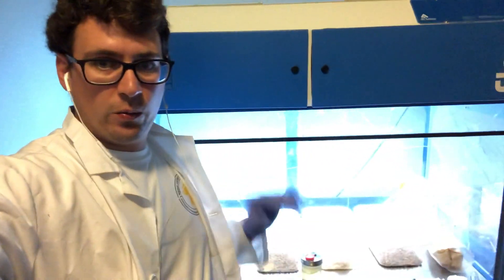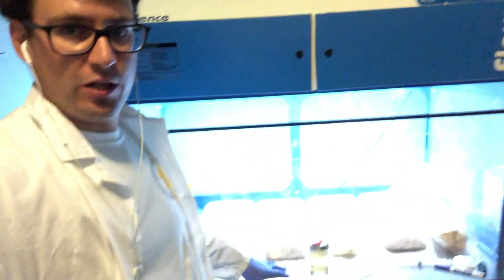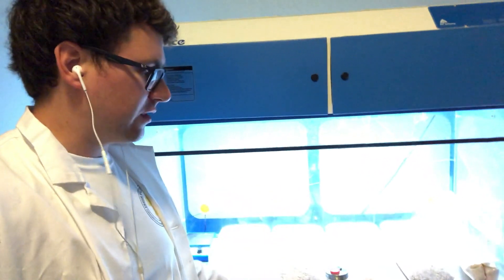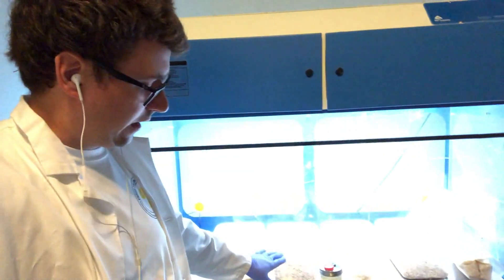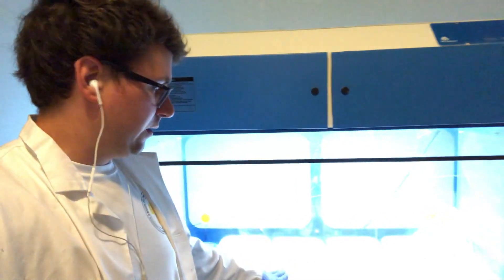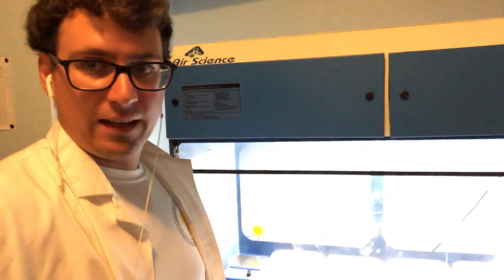Alright guys, so we just got our first four inoculations done. A little bit of feedback I'm going to be changing — I feel like the rice wasn't cooked evenly, so I might try to do less per bag so it's more homogenous. And then the oats, I feel like they're a pretty good moisture content, but maybe going a little thicker on the oats. I use three cups, so I'll probably up it to four or five cups. I'll keep you guys updated on this.